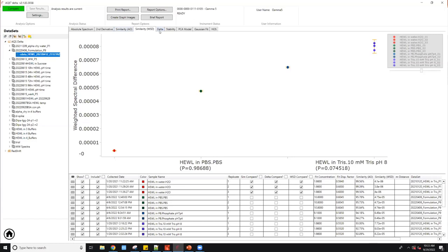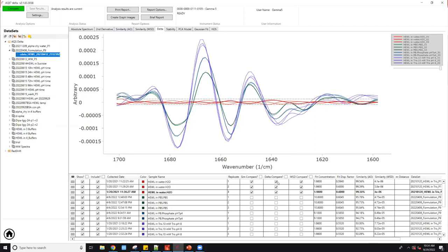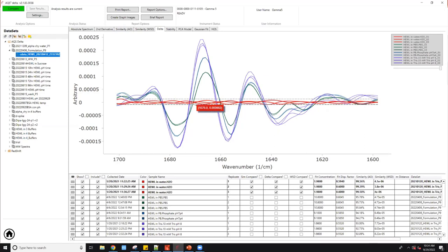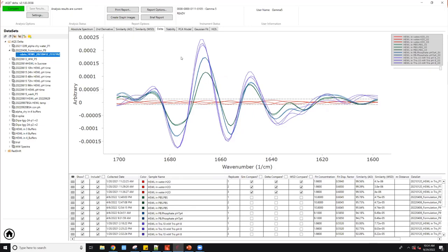Now what if we just want to look at the spectrum at different wavenumbers to see more information. The delta plot allows you to have a really nice visual of the differences. Because the delta compare is checked in this water sample, all the water is within the dashed line and all the other curves are compared to the average of the water result. This is for you to visually see it.